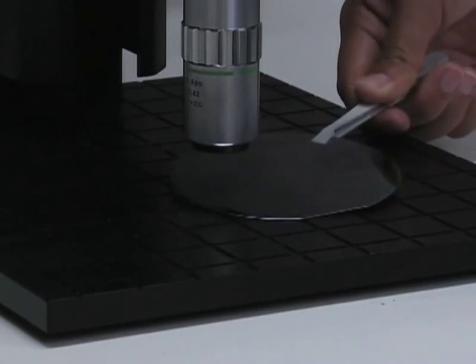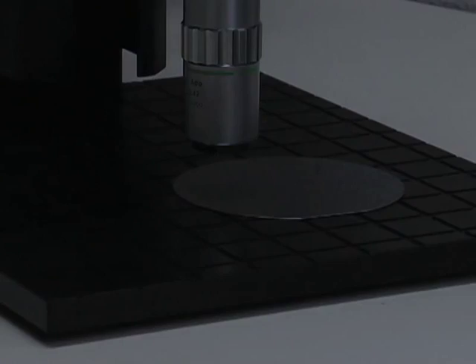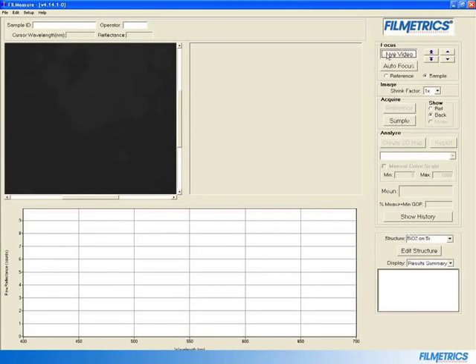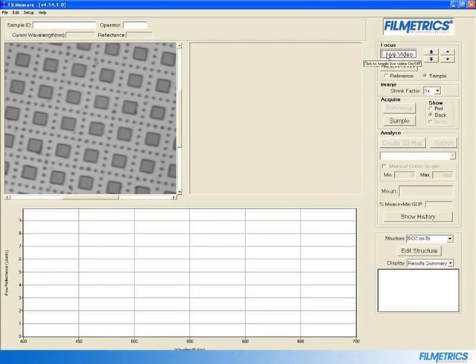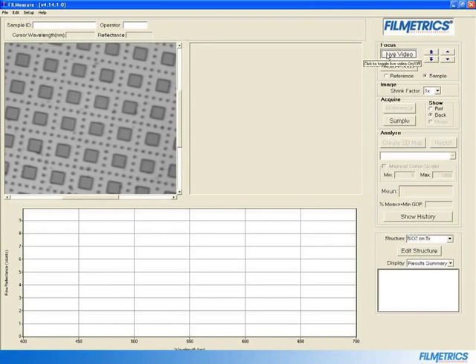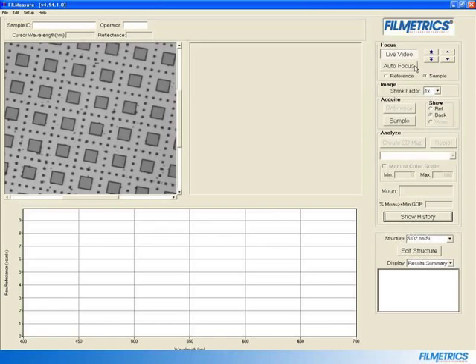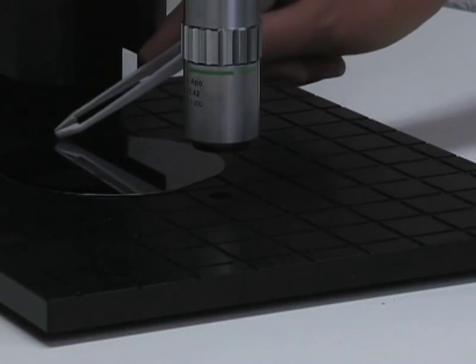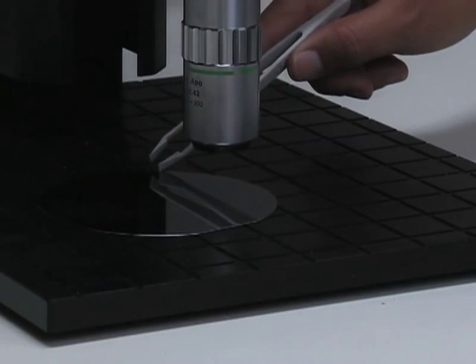Place your wafer under the objective and click on Live Video. Focus the objective onto the sample. You may find it helpful to use a focus portion of the wafer for this step. Once it is in focus, move the wafer to the SiO2 portion and click on Sample.